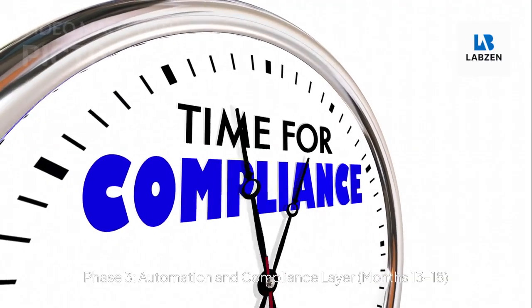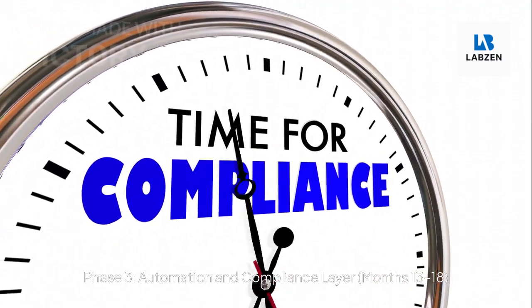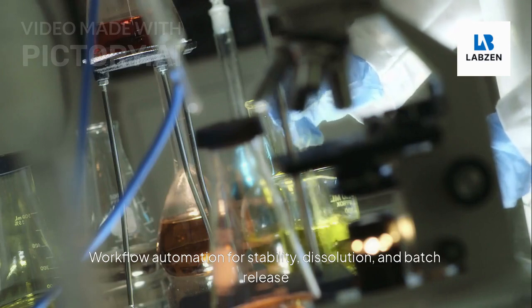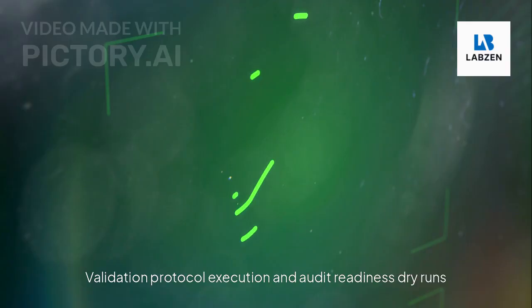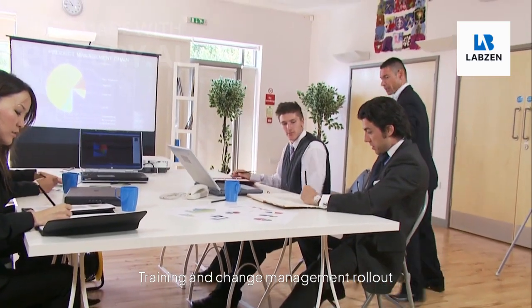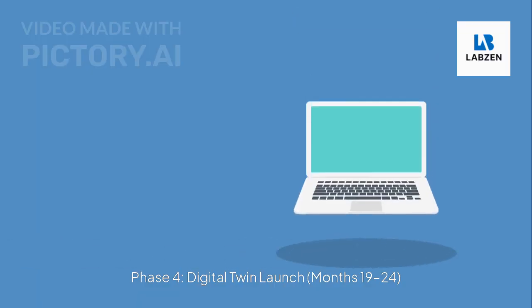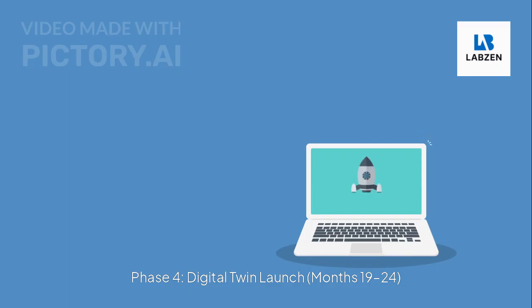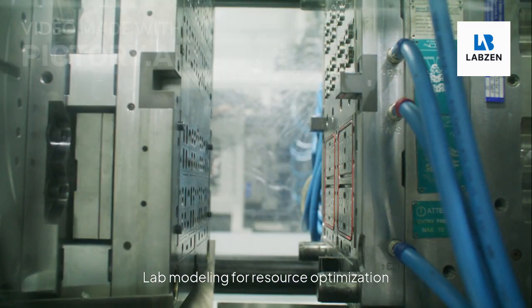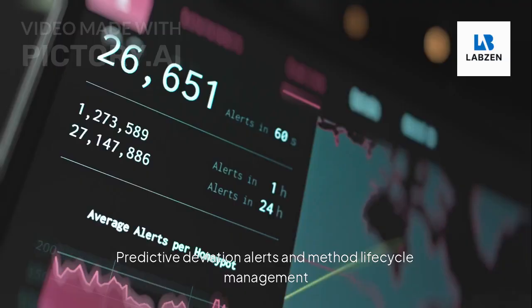Phase 3: automation and compliance layer, months 13 to 18. Workflow automation for stability, dissolution, and batch release. Validation protocol execution and audit readiness. Dry runs. Training and change management. Rollout. Phase 4: Digital Twin launch, months 19 to 24. Real-time analytics dashboards, lab modeling for resource optimization. Predictive deviation alerts and method lifecycle management.